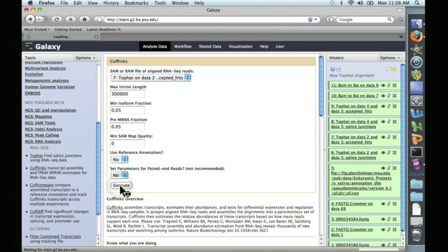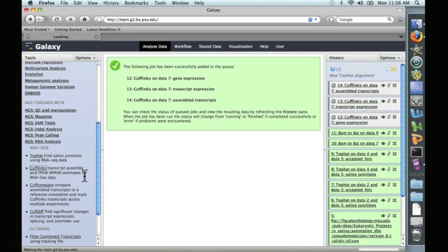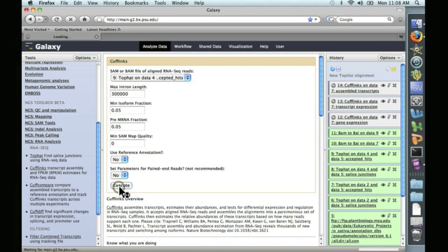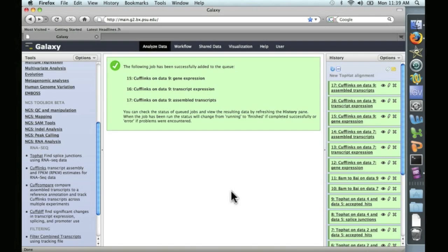Click on Execute, and we'll let that run. We'll also go ahead and queue up Cufflinks for the second alignment. And that took about 25 minutes. So we've run Cufflinks now on both of the two TopHat alignments.